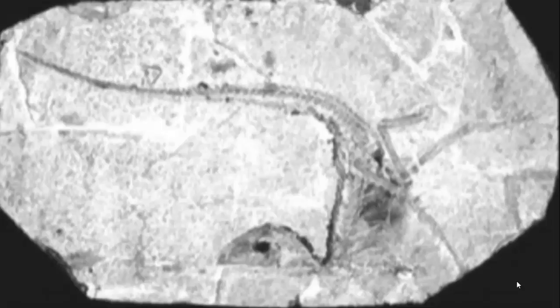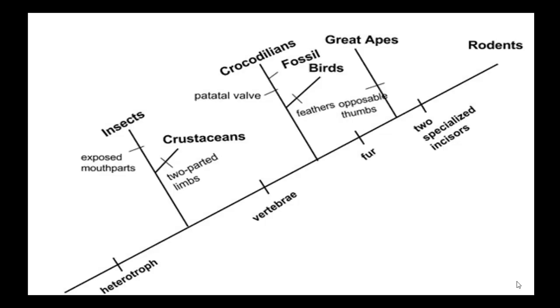on the fossil cladogram. Pause the video and make some general observations about the morphology. Form an initial hypothesis as to where you believe the specimen should be placed on the cladogram, based on the morphological observations you made earlier. Now let's learn to use BLAST.